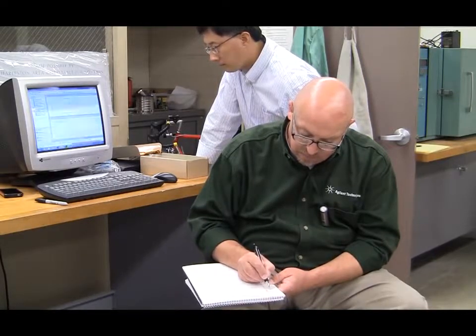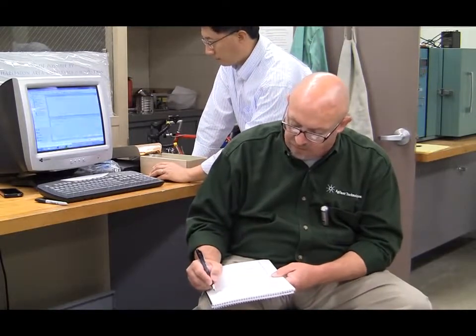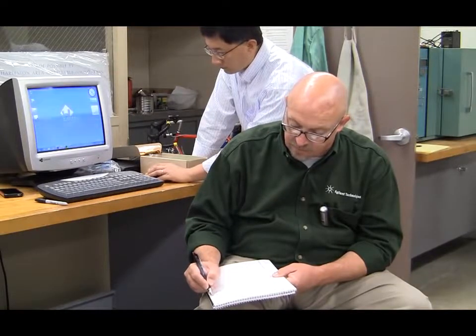The sample, in this case air, is being pulled into here by the suction pump and out the back. And this is set by the sample time in the software in seconds. Once we've reached however many seconds we've got this set for, which is 15 on the right now, this pump shuts off.